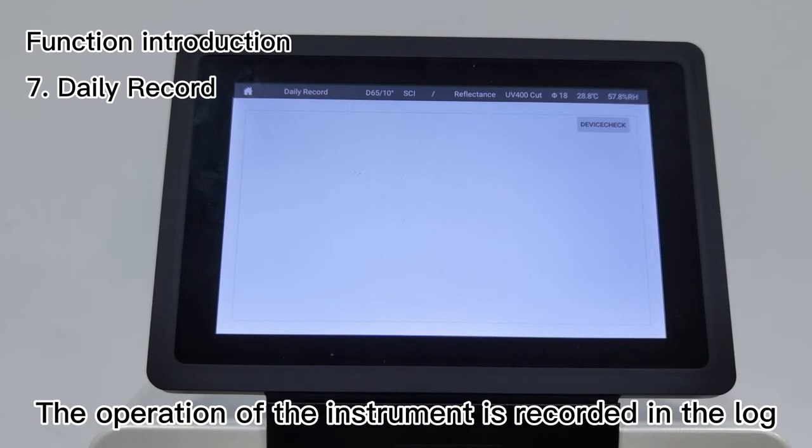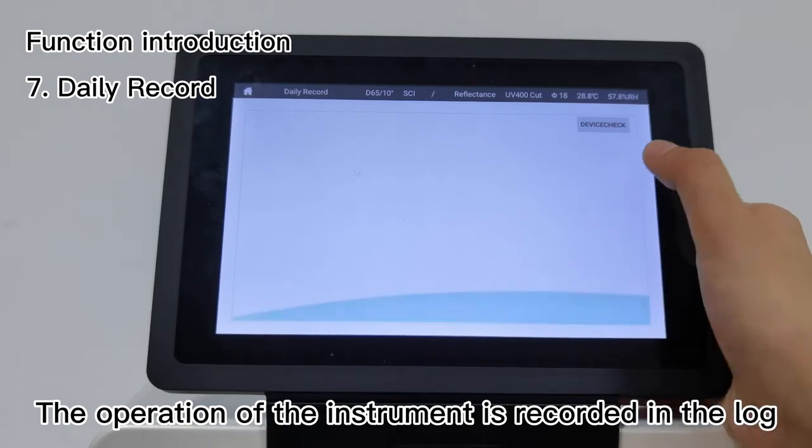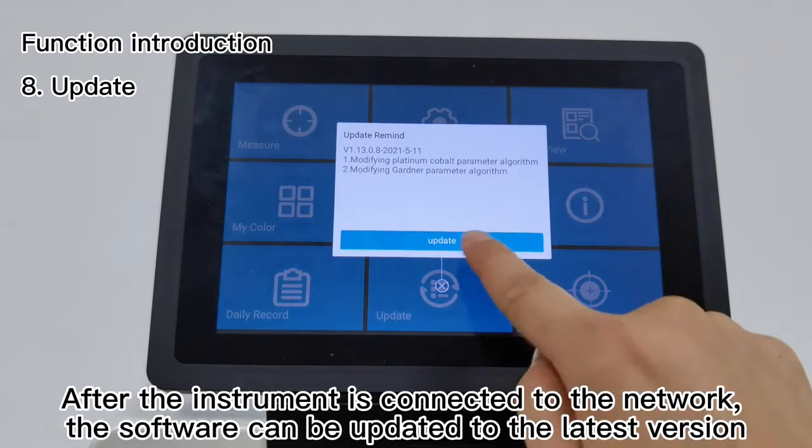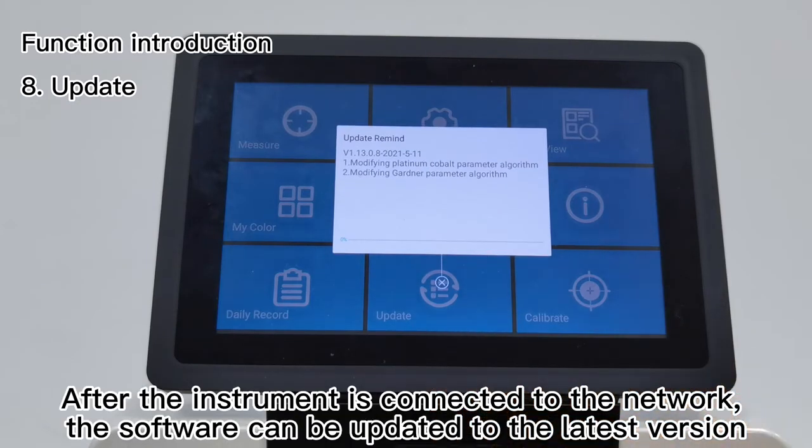The operation of the instrument is recorded in the log.